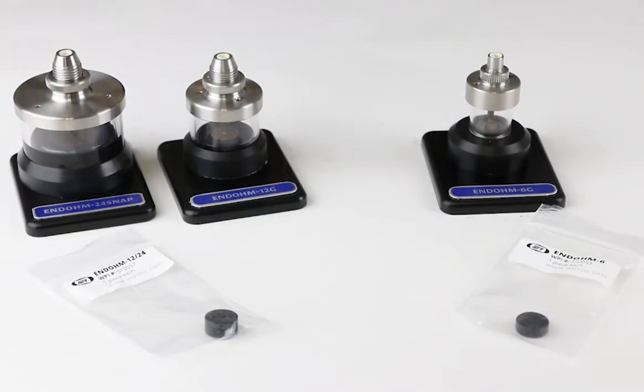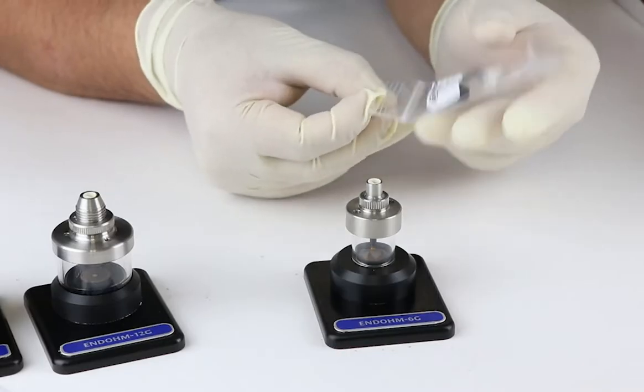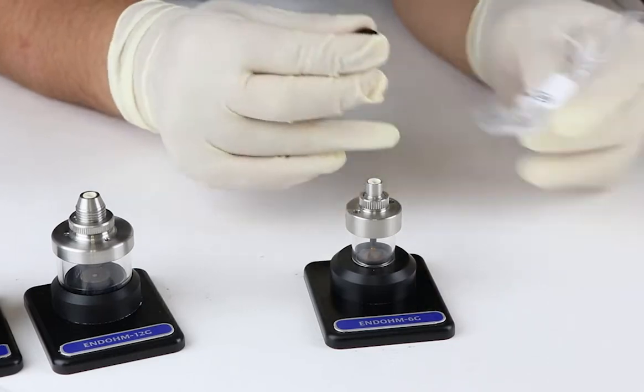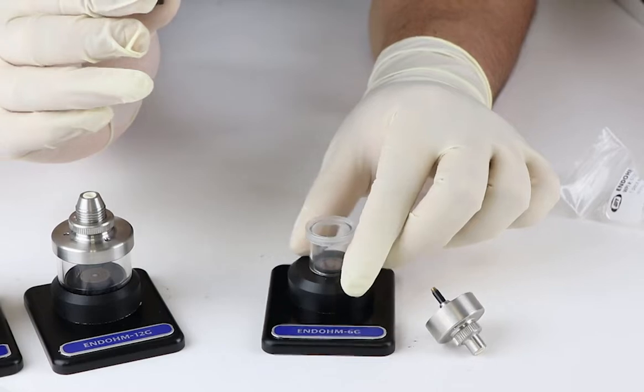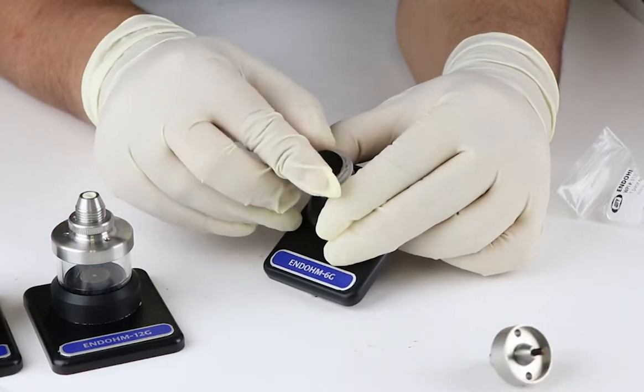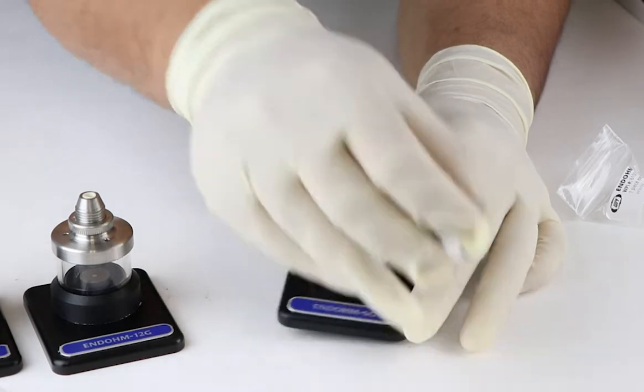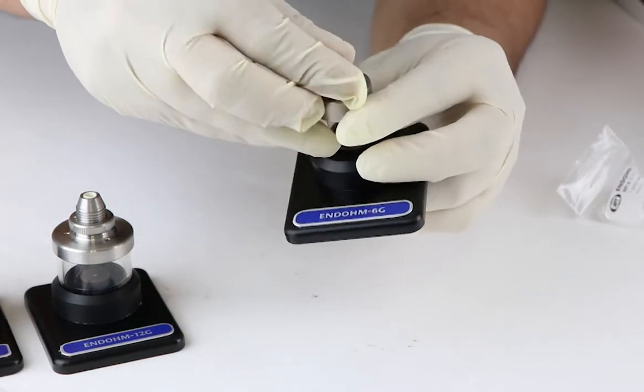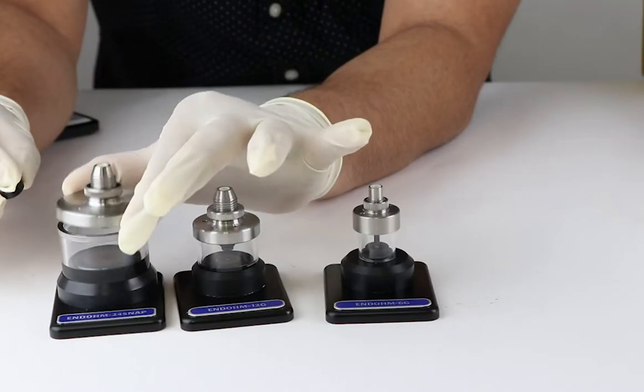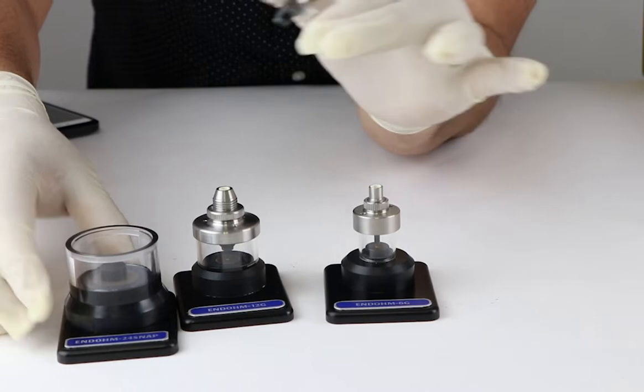In your EndOhm chamber box, you'll notice a black colored disc called a spacer disc. A 4mm spacer disc (part number 6100053) is used for EndOhm-6G, and a 6mm spacer disc (part number 6100057) is used for either EndOhm-12G or EndOhm-24SNAP.